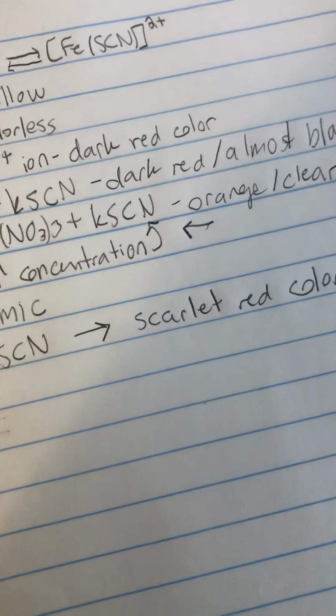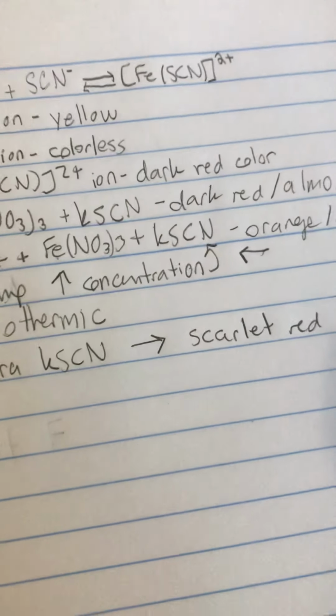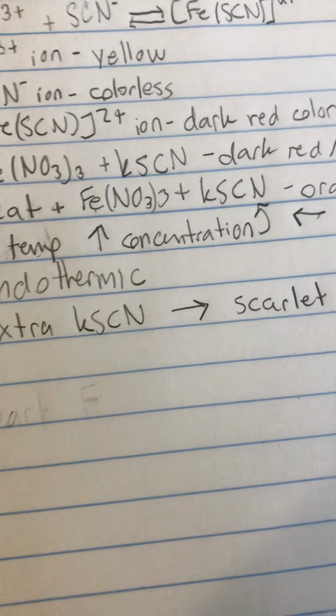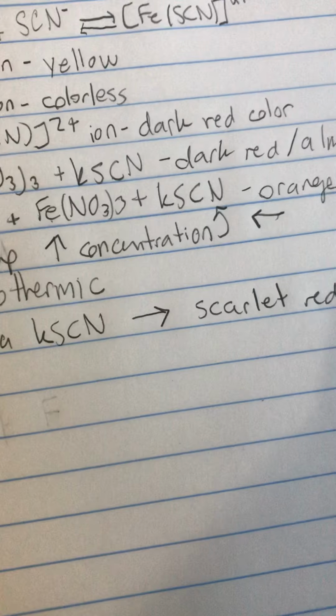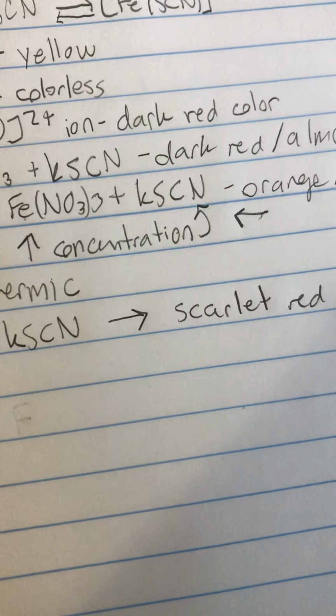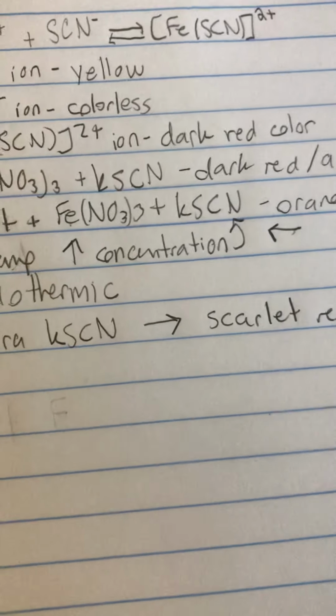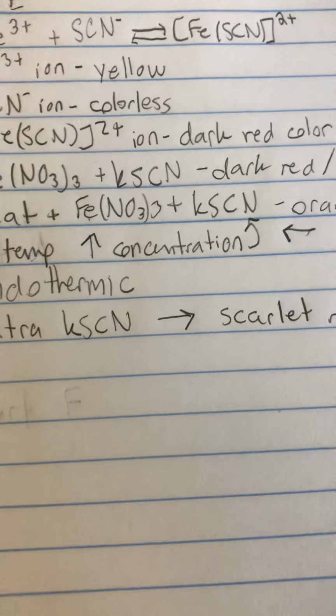The next question says, what precipitate formed when AgNO3 was added? Explain the equilibrium shift that occurred when AgNO3 was added. You might find it helpful to consult a solubility table.